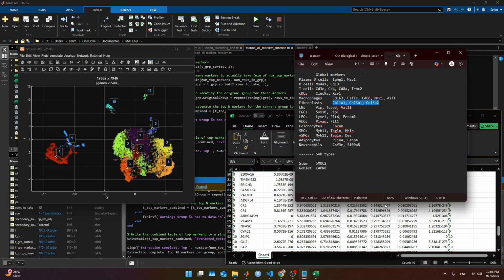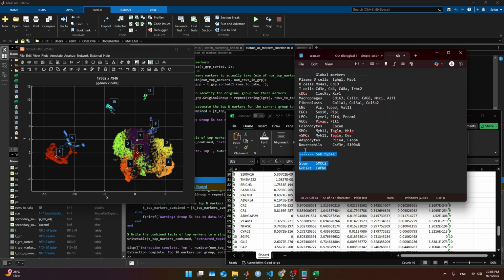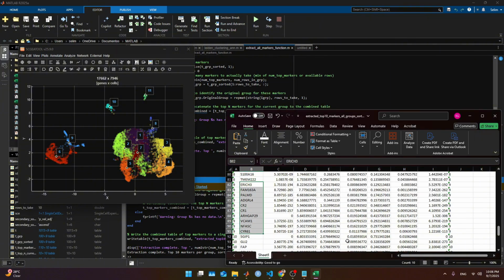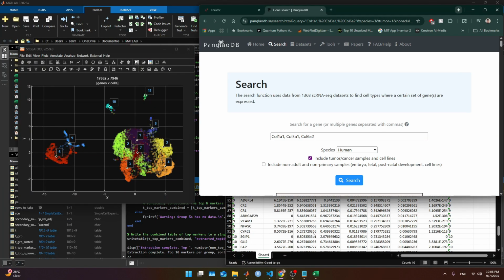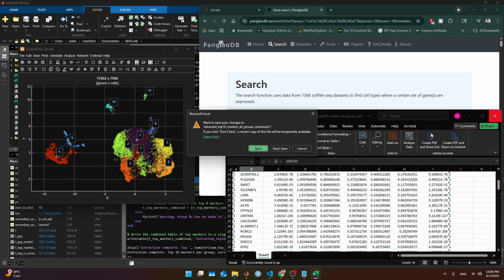So far, what we learned here is that we can build our own marker genes only if it makes sense from the clusters and from what we can find out in the corresponding websites to curate the genes. So again, let's do this one more time.